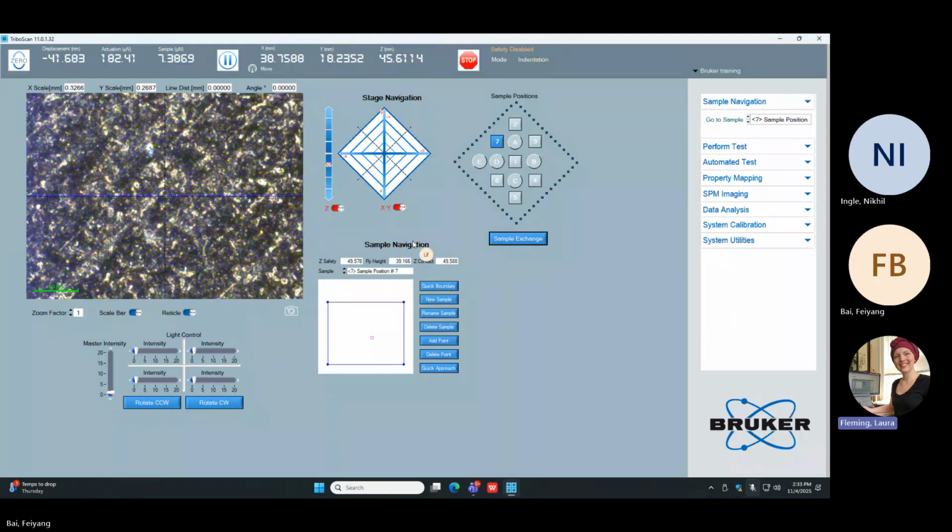Good. Okay. So this sample zone is the optical view here. This is how big it is. So it just makes a sample zone the same size as the optical view at the center of this predefined sample location. Okay, so it's kind of like the quick approach, the quick boundary, sorry. Right, it's the quick boundary, but instead of having to focus on the sample first, you can just load it and click the button. Yes.